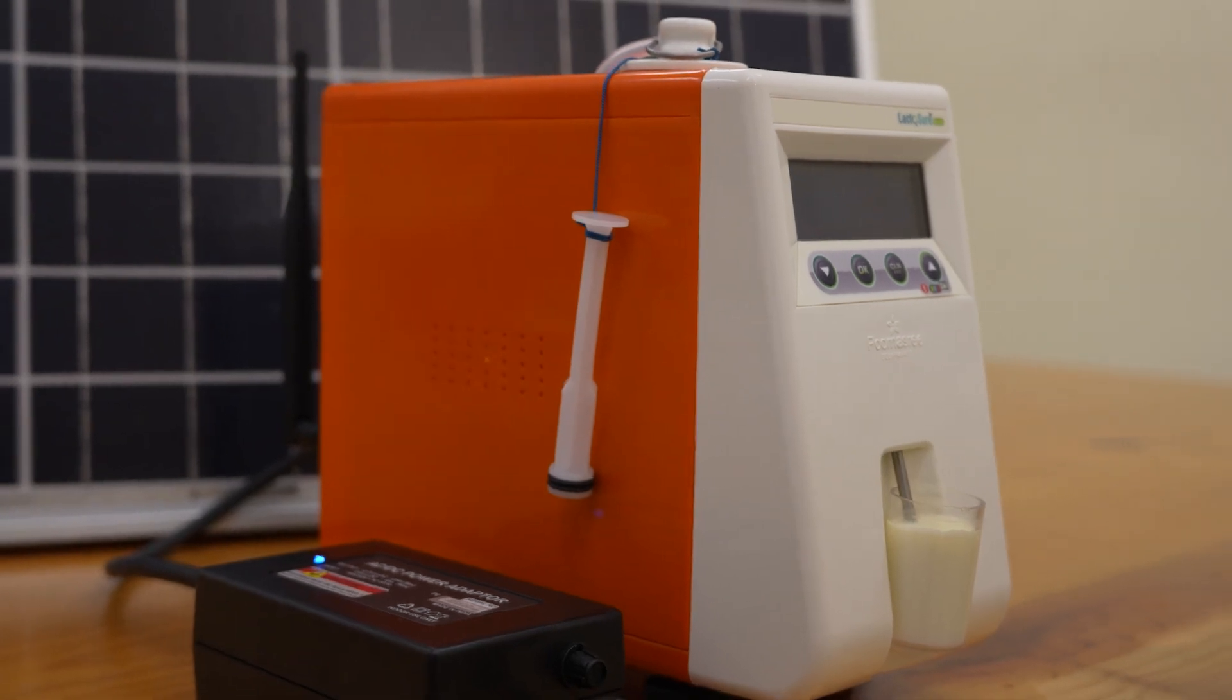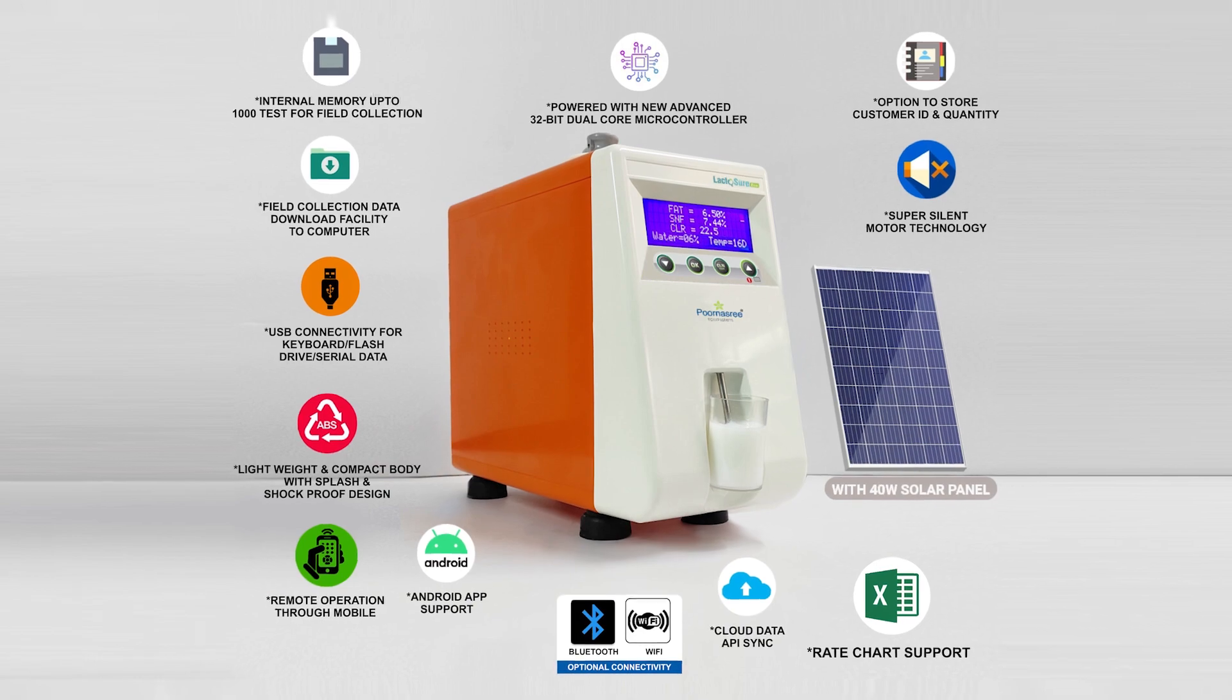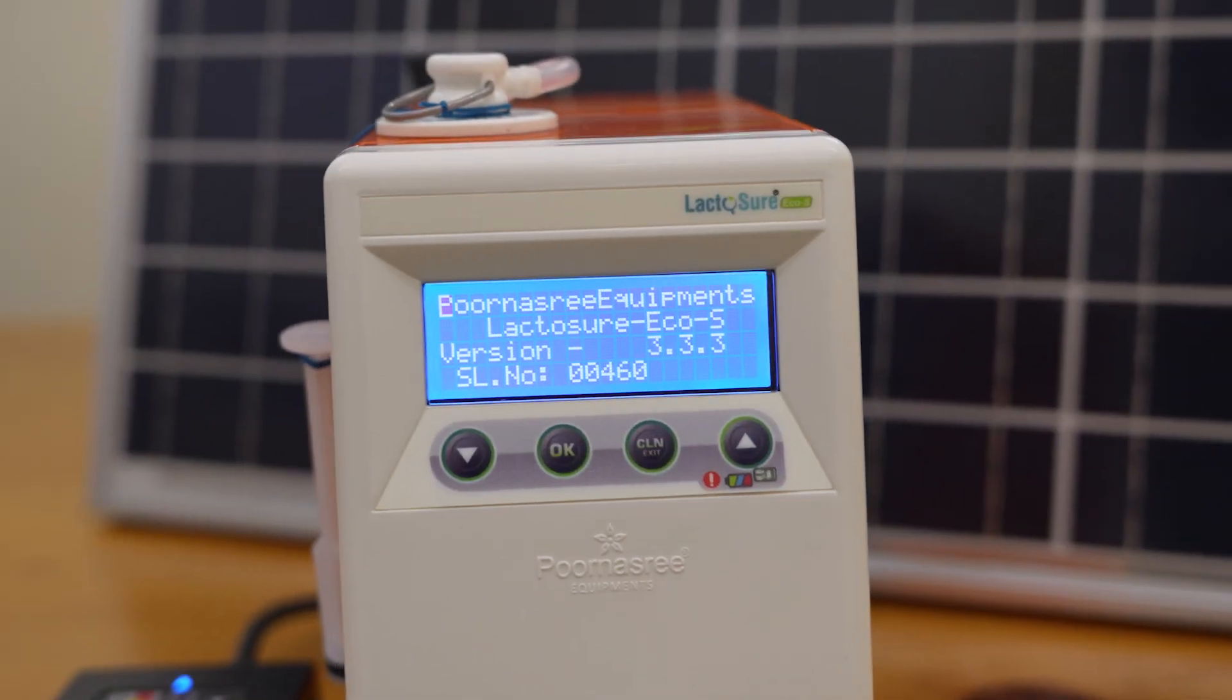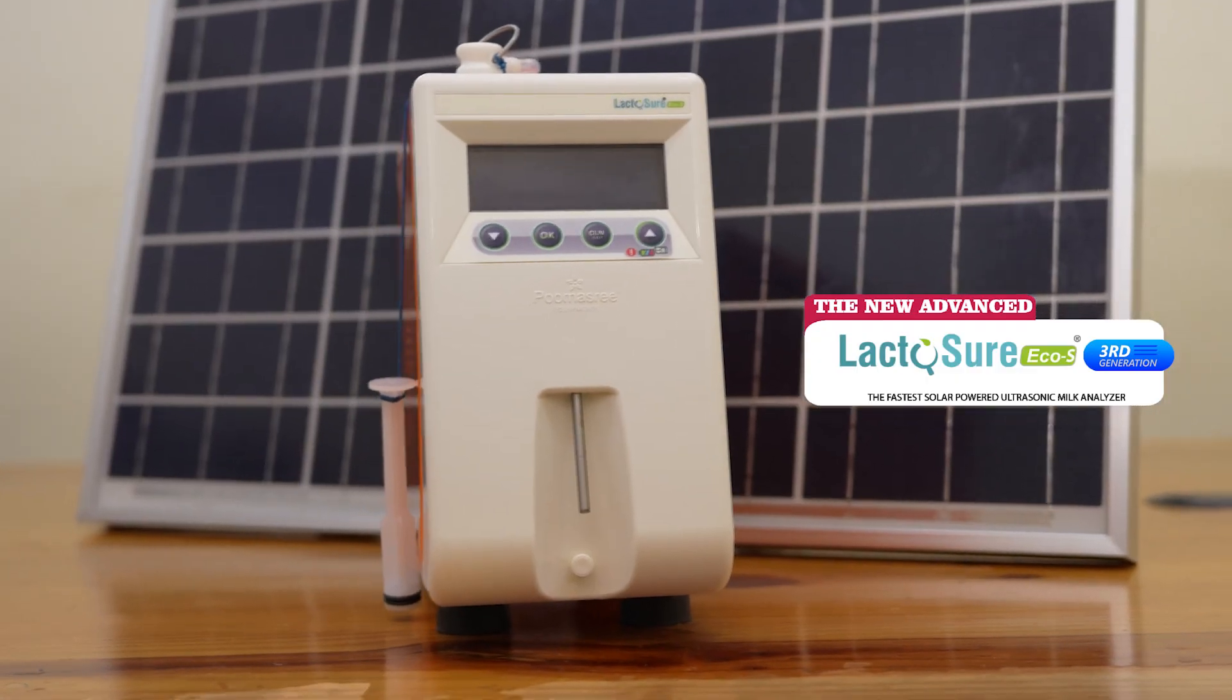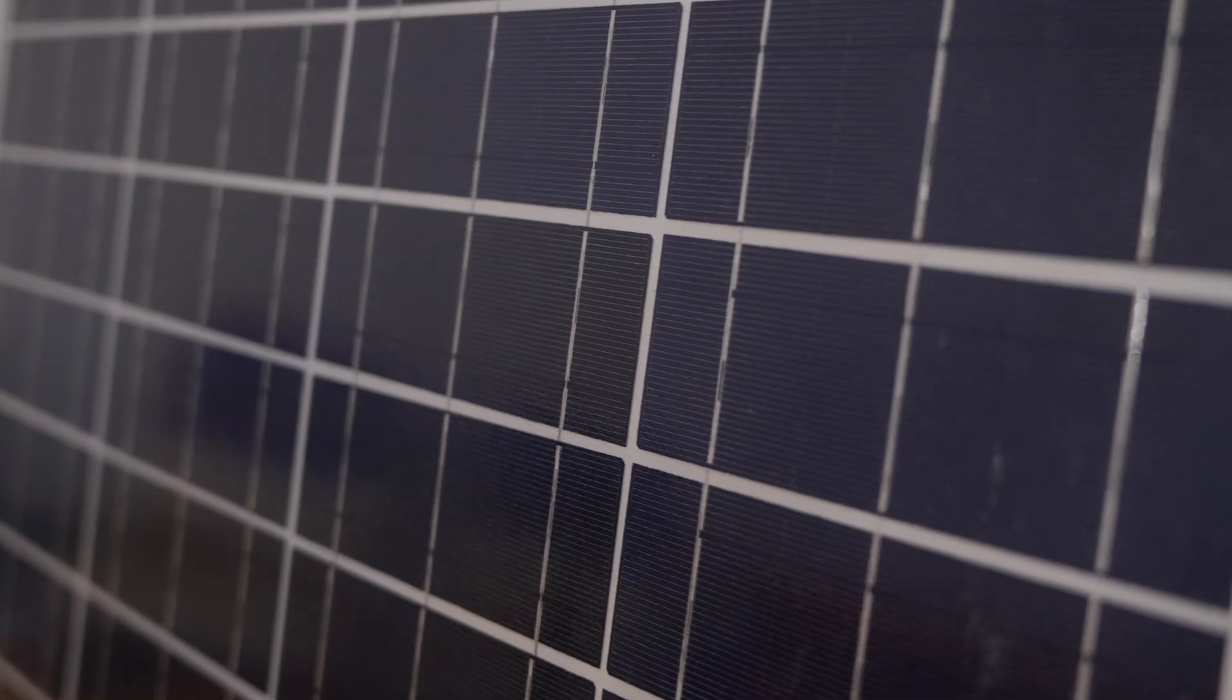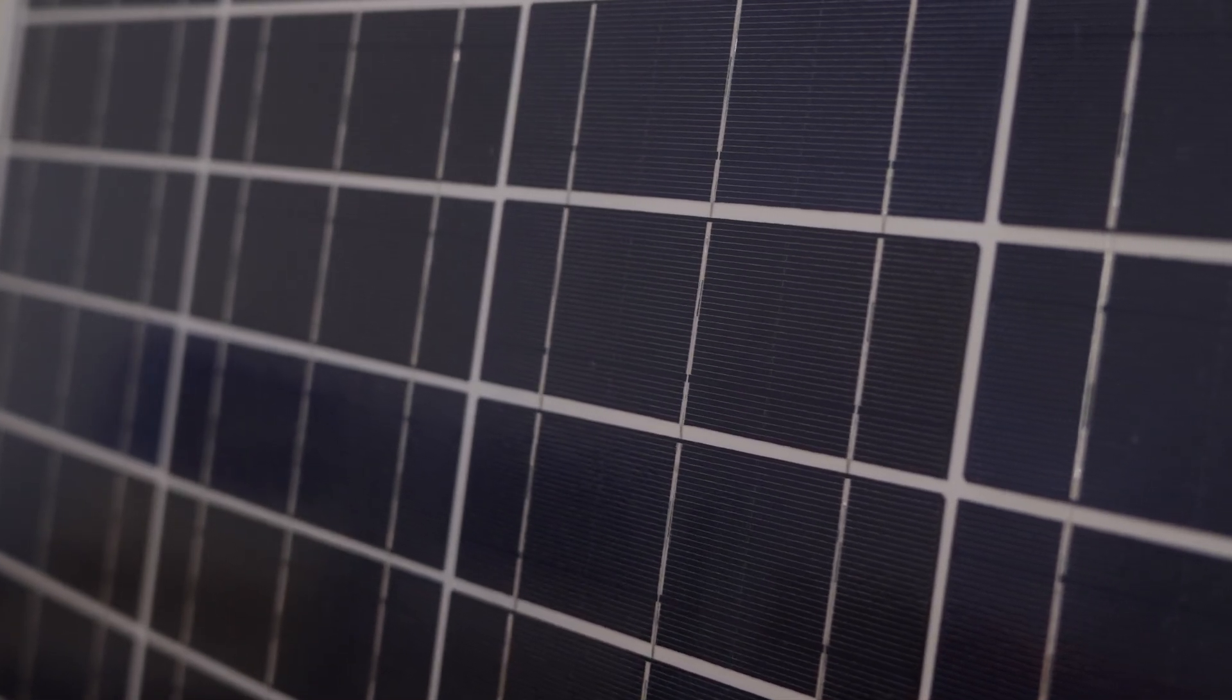Hi friends! Today we are introducing the latest version of solar powered battery model of ultrasonic analyzer under the Lactoshore brand manufactured and marketed by Purnasri Equipments. Lactoshore Echo S is the most accurate and fast tabletop solar powered battery analyzer that is currently manufactured in India.